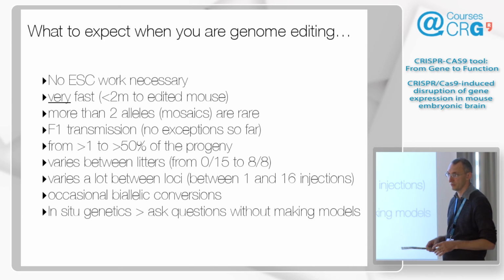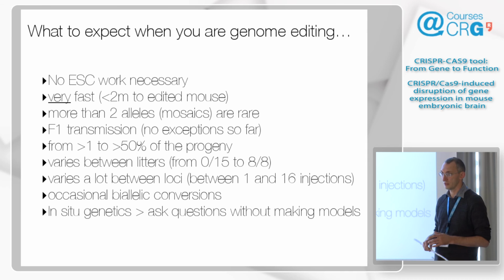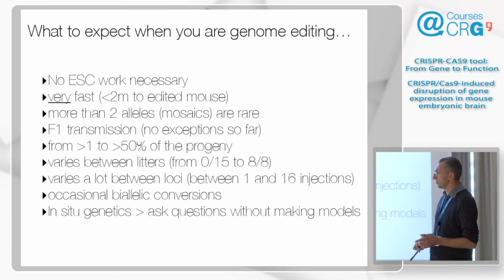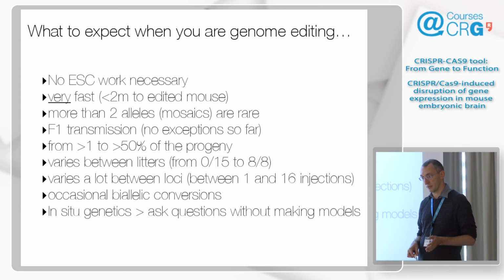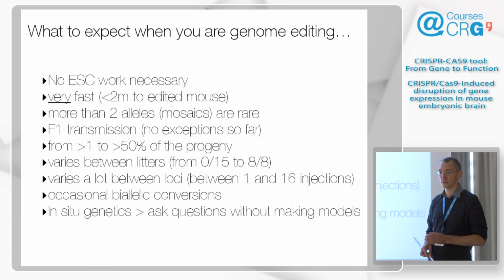This has always been a problem in the past. Here, we don't even worry about it anymore. Then efficiency can be very high, as I showed. We had some litters where 8 out of 8 mice were edited, but of course this varies a lot.